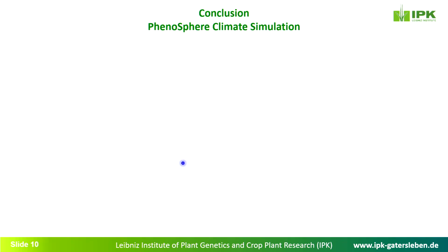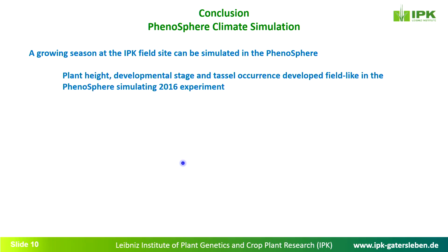So let's come to the conclusion of this experiment. A growing season at the IPK field site can be simulated in the PhenoSphere. Plant height, developmental stage, and tassel occurrence developed field-like in the PhenoSphere, simulating the year 2016.